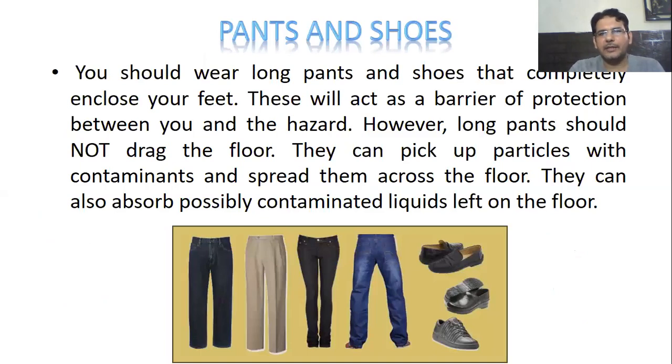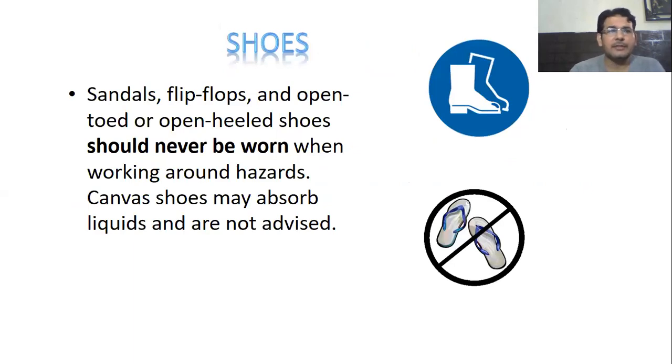So first we discuss about pants and shoes — what type of pants and shoes we should wear. You should wear long pants and shoes that cover your feet, as these act as barriers of protection between you and the hazard. However, long pants shouldn't drag the floor; they can pick up particles with contaminants and spread them across the floor, and can also absorb possibly contaminated liquid left on the floor. About shoes, we shouldn't wear sandals, flip-flops, or open-toed or open-heel shoes when working around hazards. Canvas shoes may absorb liquids and are not advised.